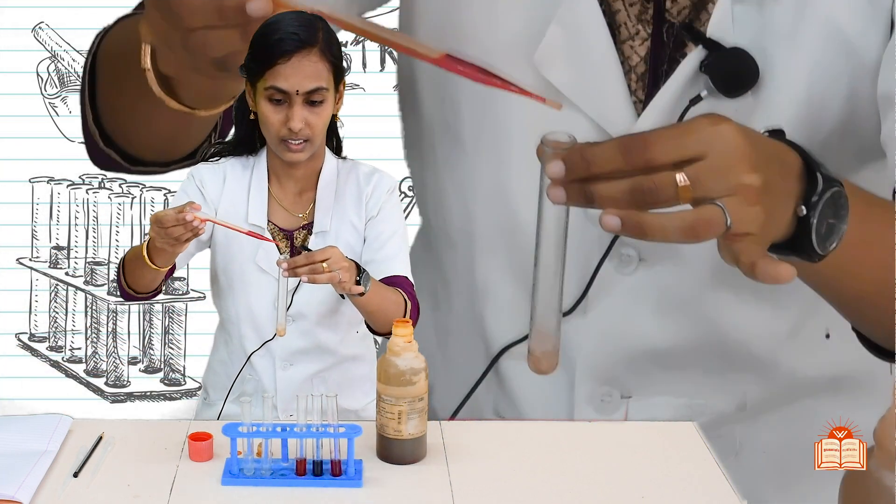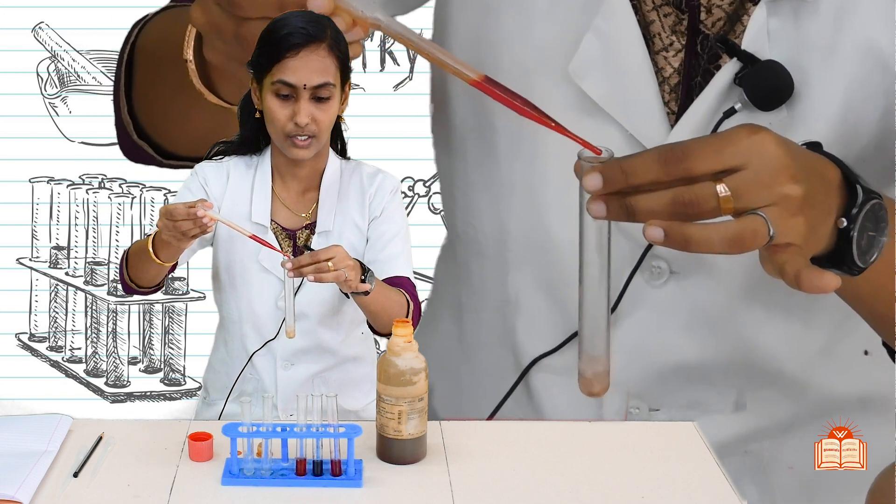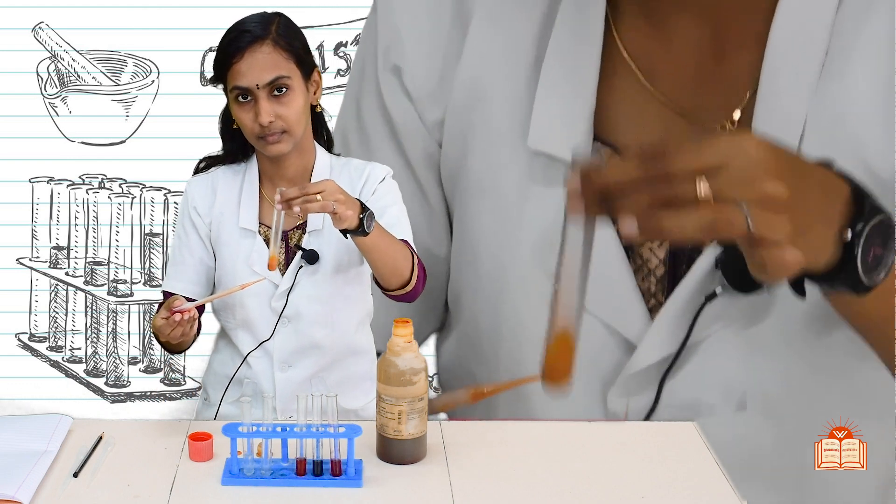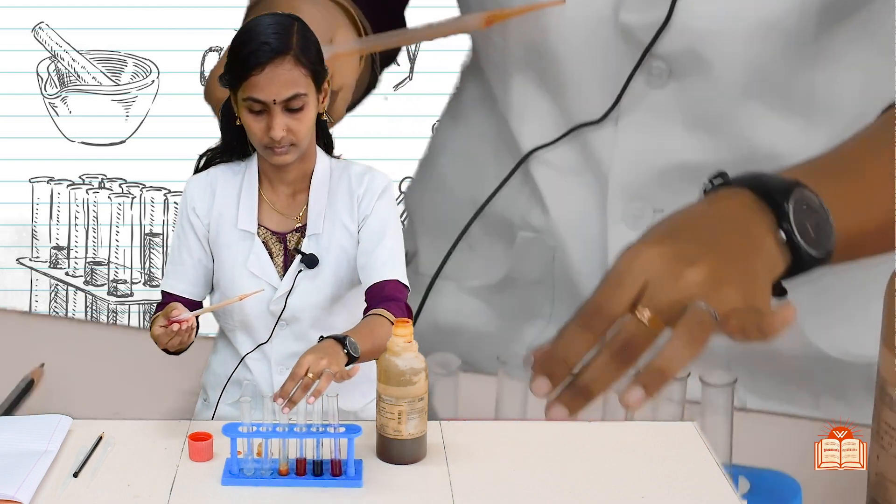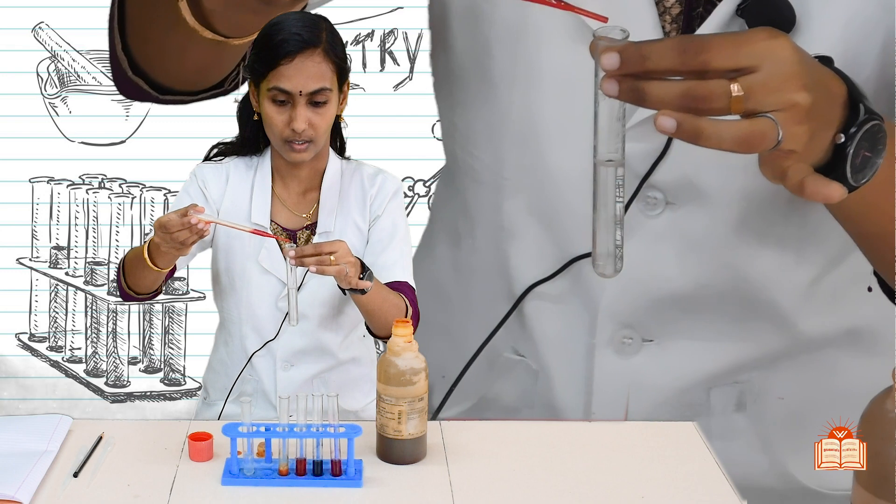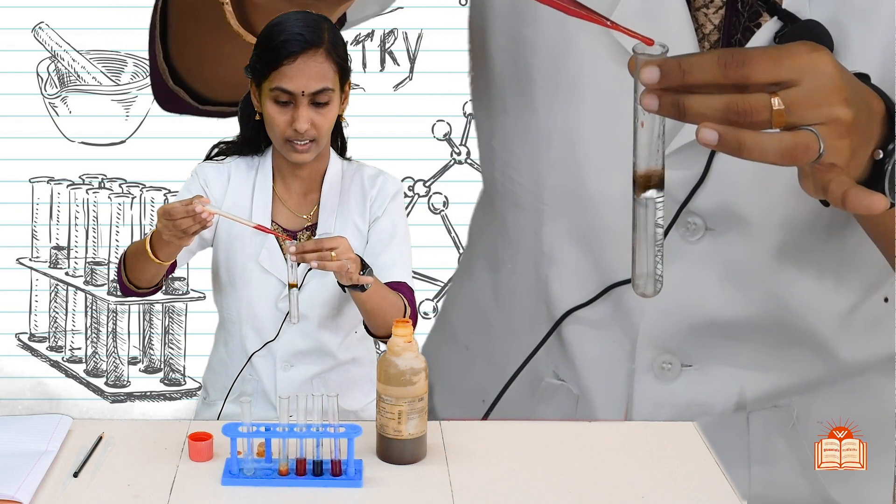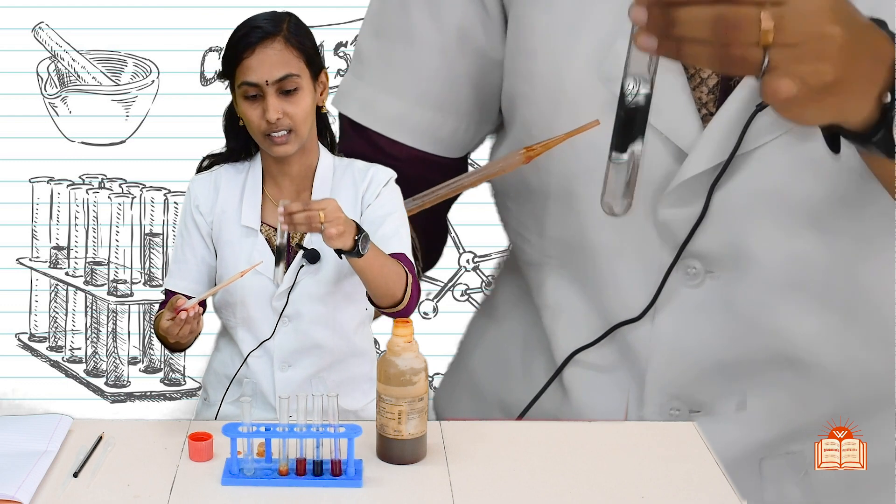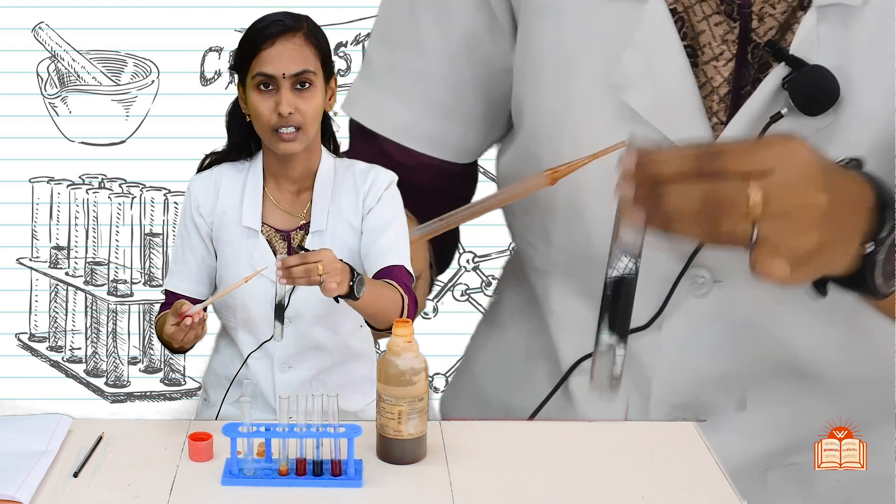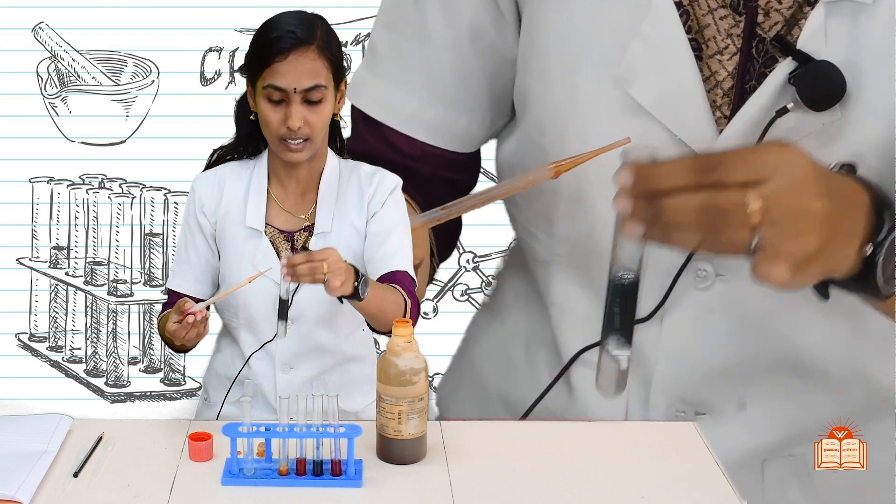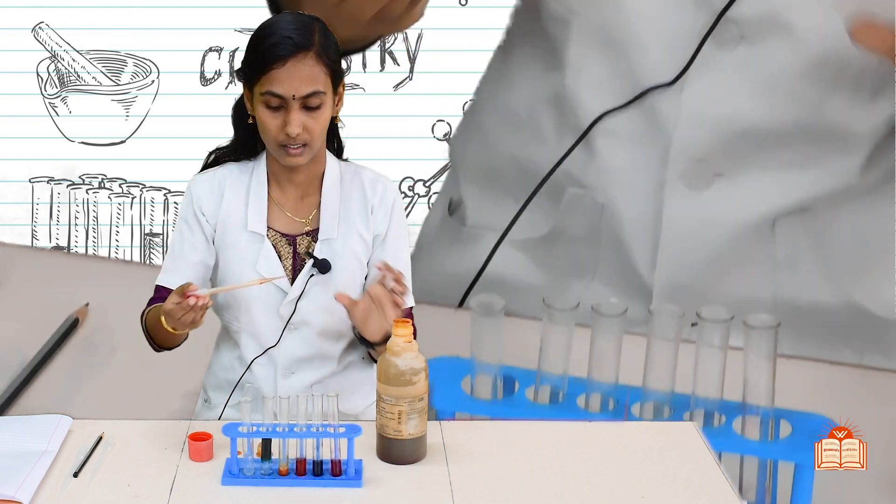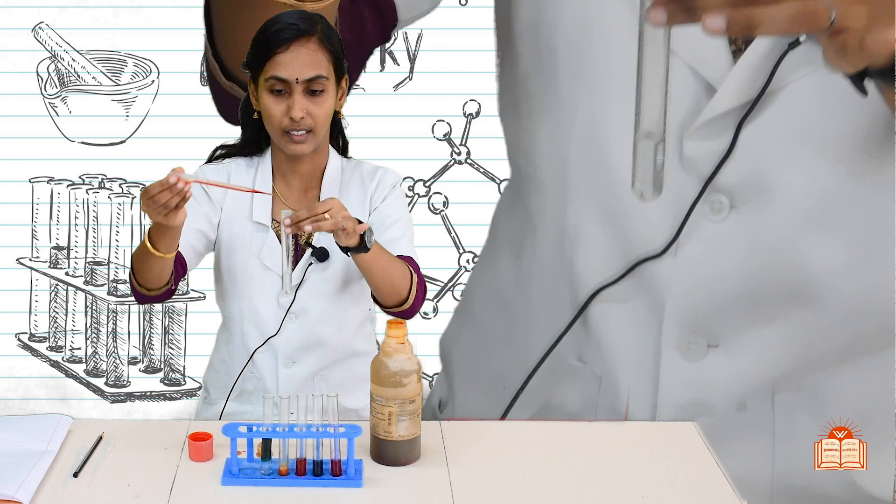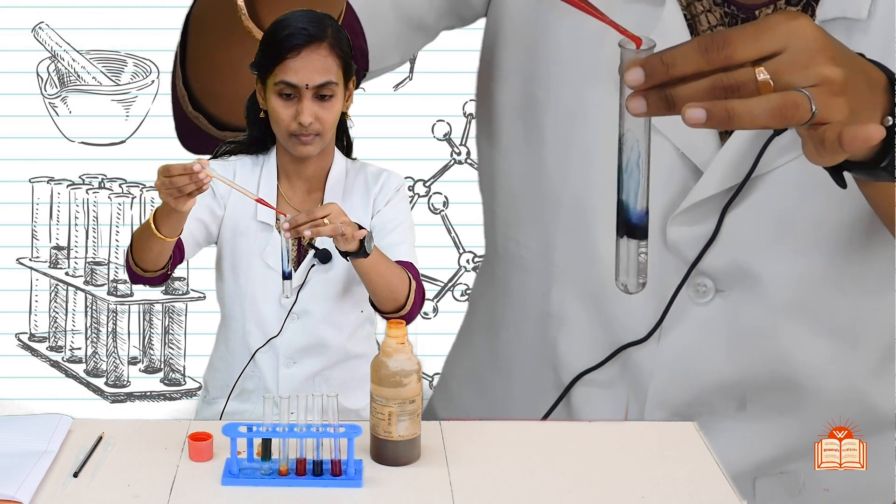Next solution is orange juice solution, see the color. Then water, we are adding to the water, see it turns to green color. Green color indicates the solution is neutral. And finally sodium bicarbonate solution.